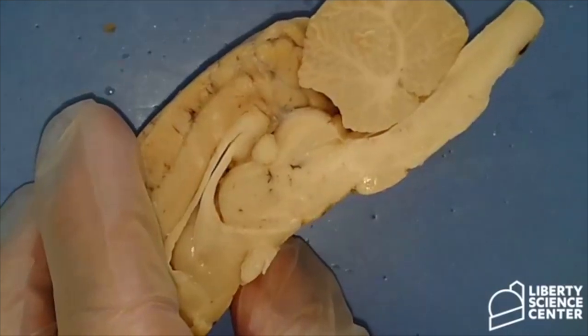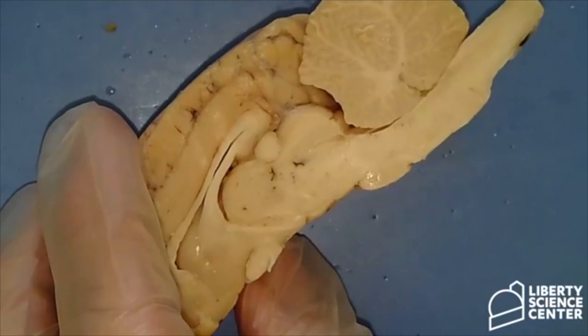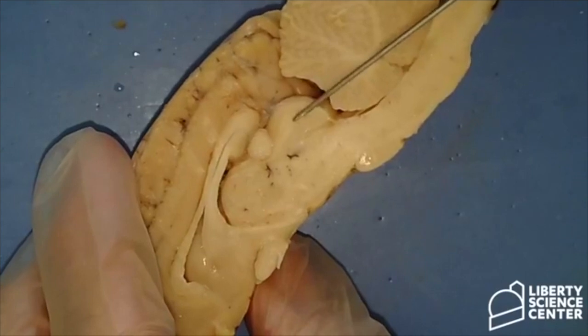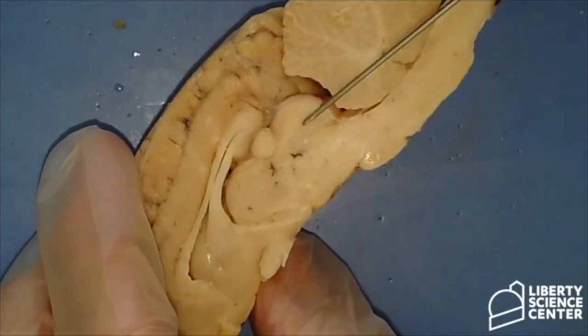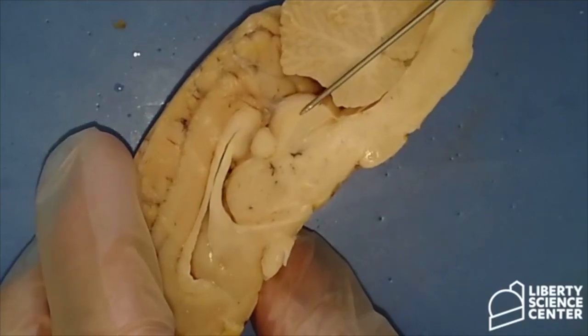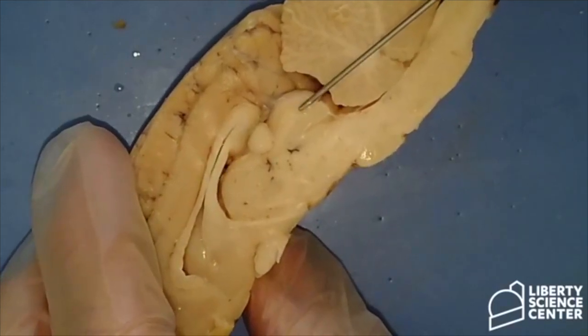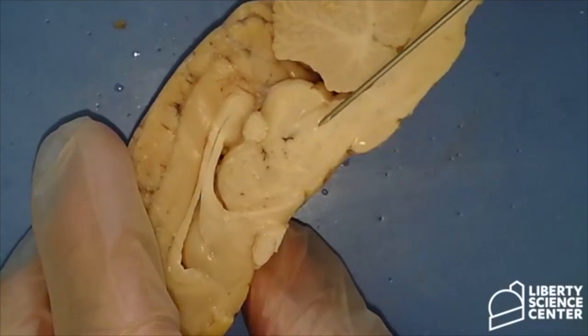Let's look at one more structure, and it's this structure right here. This is the superior colliculus. This portion helps coordinate movements of the eyes, the head, and the neck in response to stimuli. I'll go a little more into detail about that. Underneath is called the inferior colliculus, which deals with auditory information, so sound.